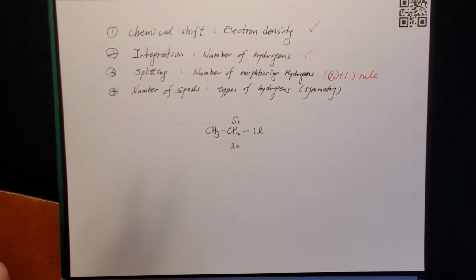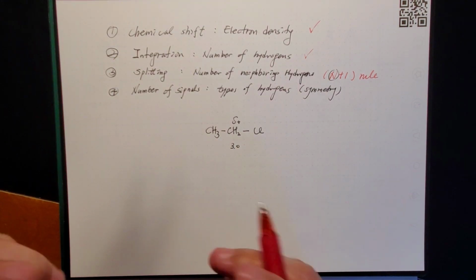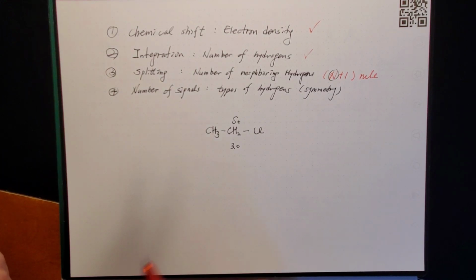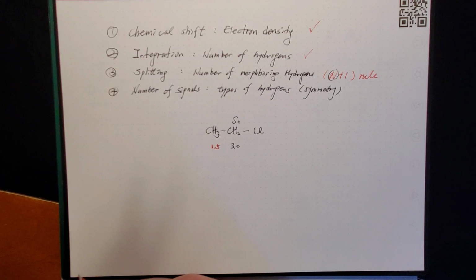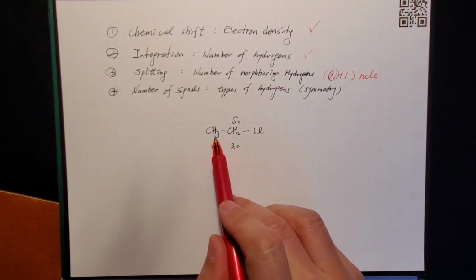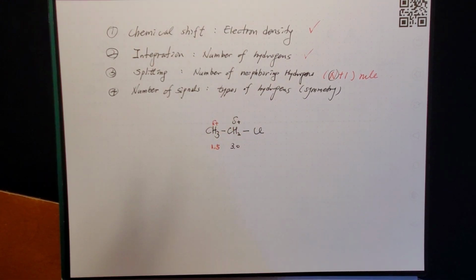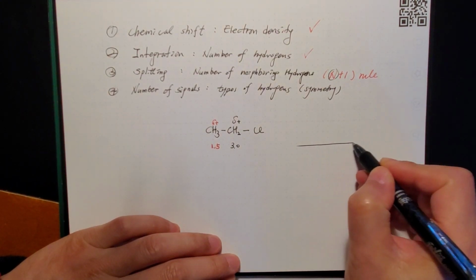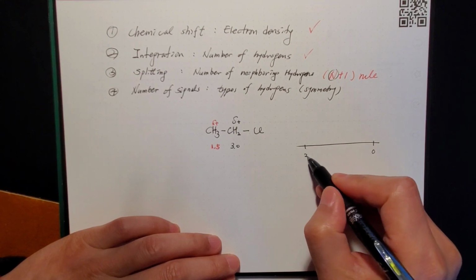Roughly speaking, for non-majors, you can say that is about 50% of the alpha hydrogen value, so roughly 1.5 ppm. It's more shielded, so somewhat less plus charge. That means you are expecting your NMR to run from 0 to 3.